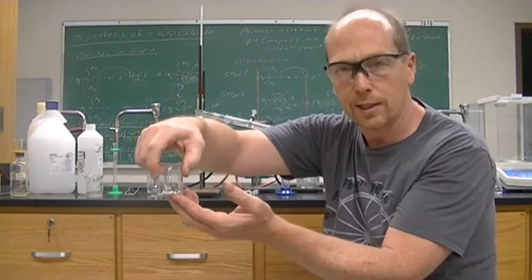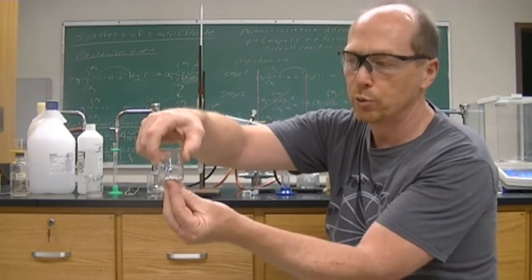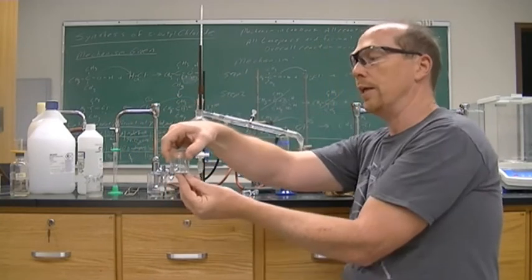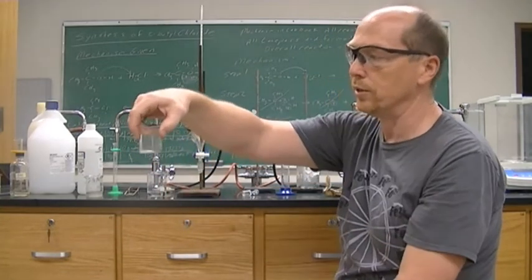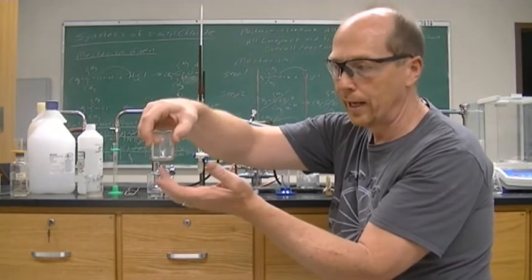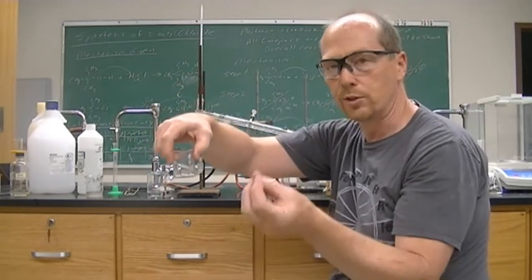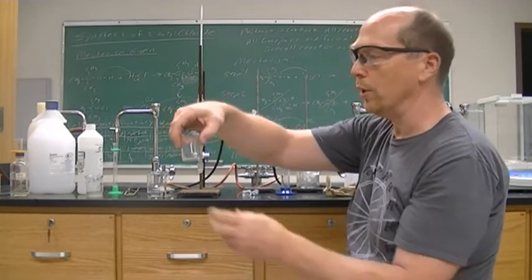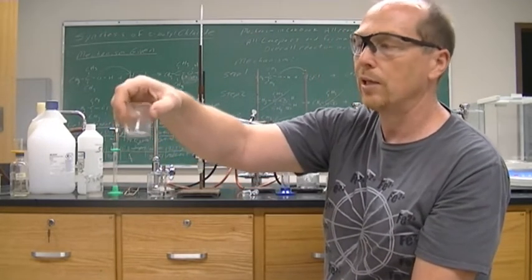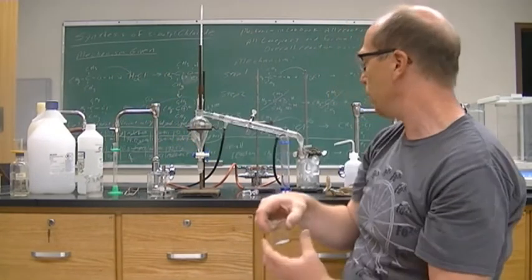You can't see anything happening here, but any water is going to be absorbed through this liquid. Calcium chloride is a dihydrate. So this is CaCl2 without water, anhydrous, and then when it reacts with water, it forms CaCl2·2H2O. It takes in all of that water, and we added a gram of calcium chloride, which will take in a lot more water than we should ever have in our product.